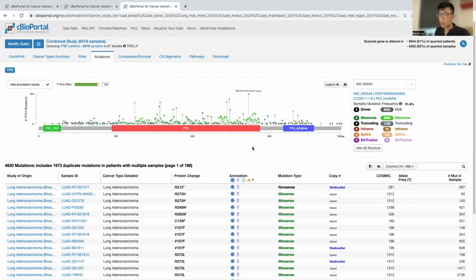Specifically, this is also non-small cell lung cancer, but you can see the taller these bars are, the more represented these TP53 mutations are, which suggests that they may be a hotspot or have some type of functional significance to warrant such a representation on this lollipop plot.